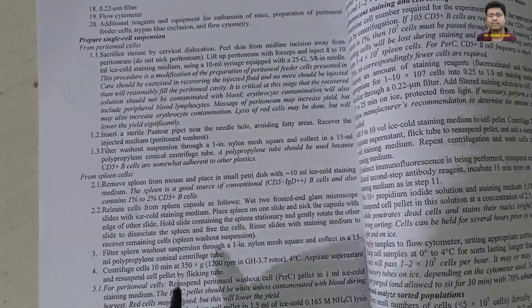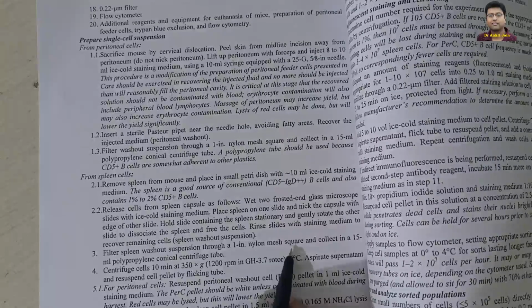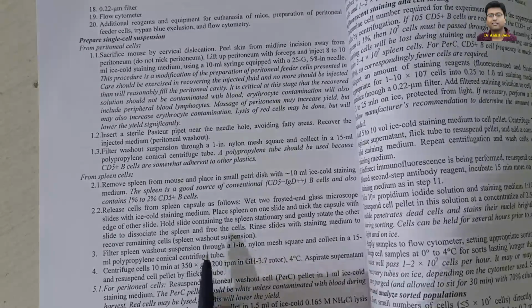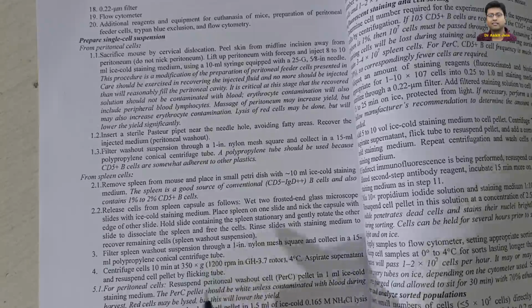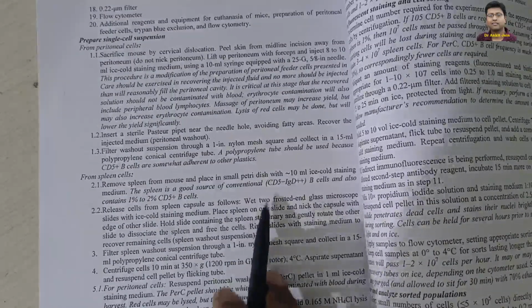Now we have to filter it with the help of 1 inch nylon mesh square and collect in 15 ml polypropylene conical centrifuge tube. Now this centrifuge tube is used because, as we know, the CD5 positive cells adhere to the other plastic surfaces. That's why we are using polypropylene tubes.